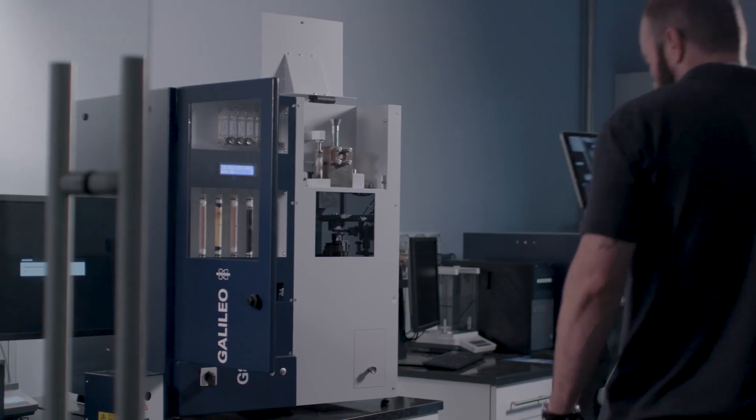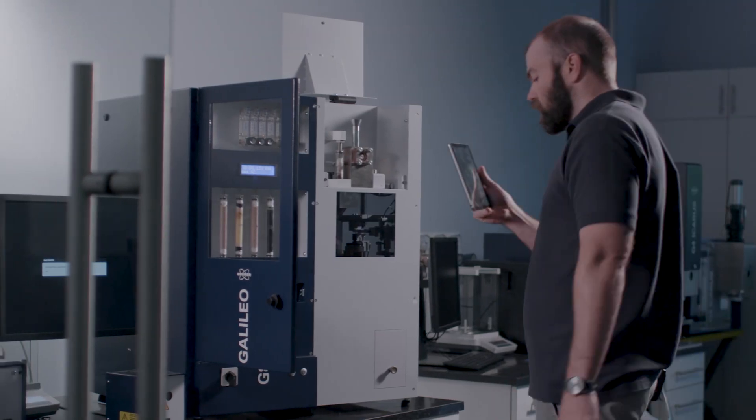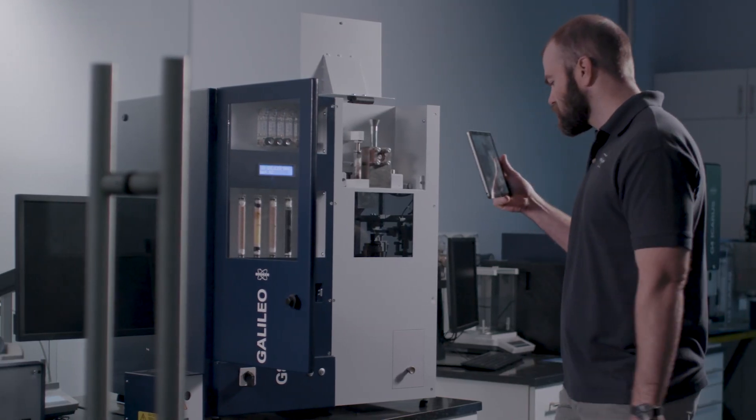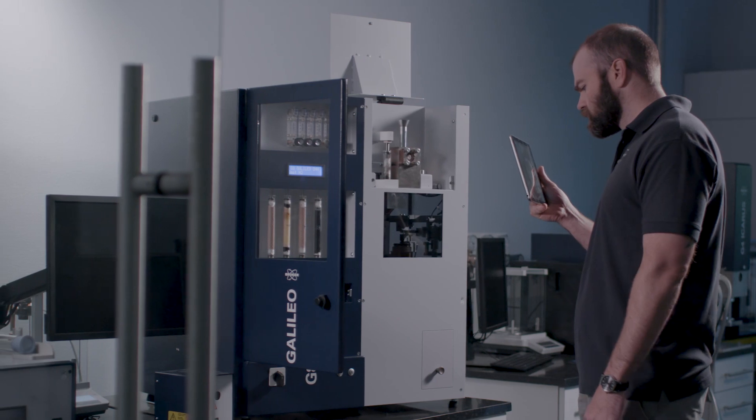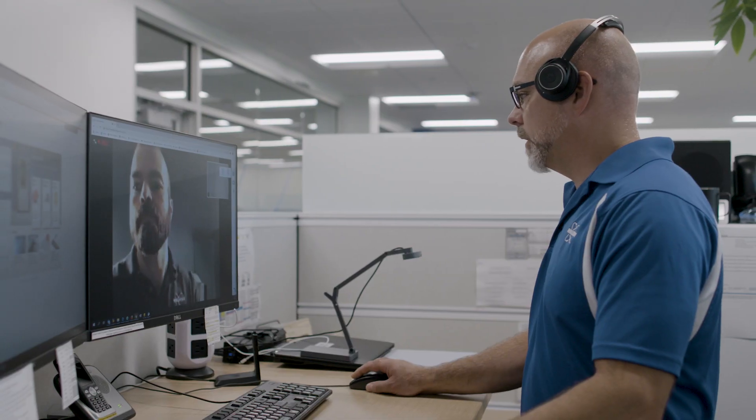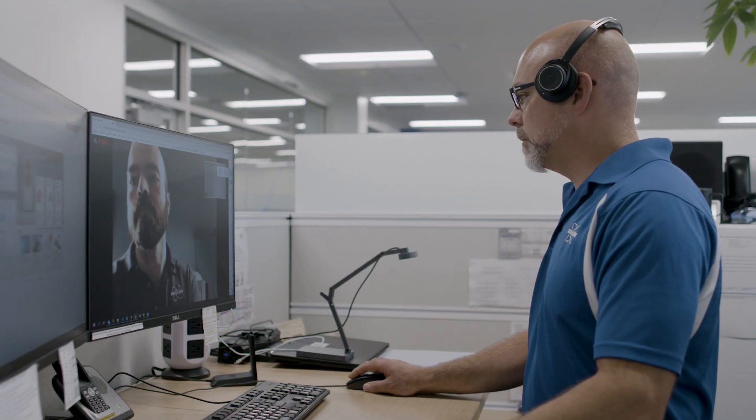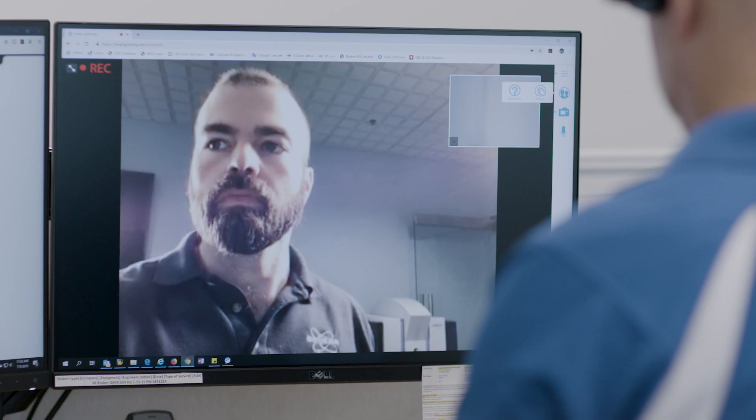Hey Andy, how are you doing today? What can I help you with? Alright Dan, I'm here at the G8 Galileo. I'm hoping you can help me change out the tubes in this thing. Yeah, sure, no problem. Let me change the camera around. I'll get to doing that.